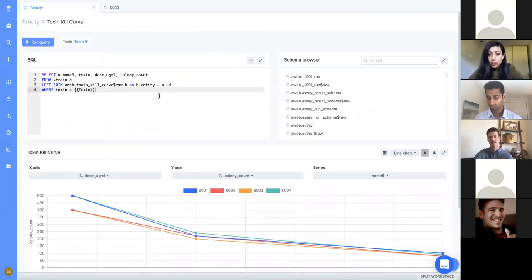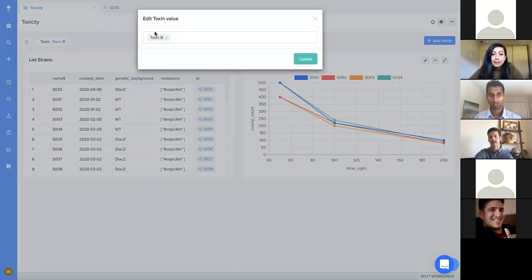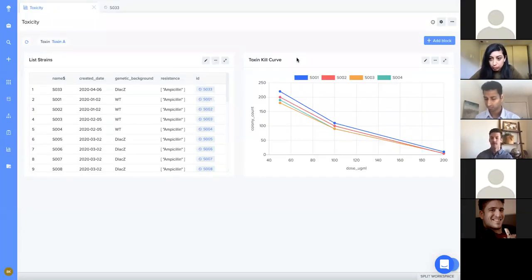So in the case of write, you have access to all of this. But if you only have read access to a dashboard, you only have access to be able to toggle the views, which is still very valuable for somebody who has read access to be able to quickly come in and see some updated live dashboards of the data that's within Benchling.